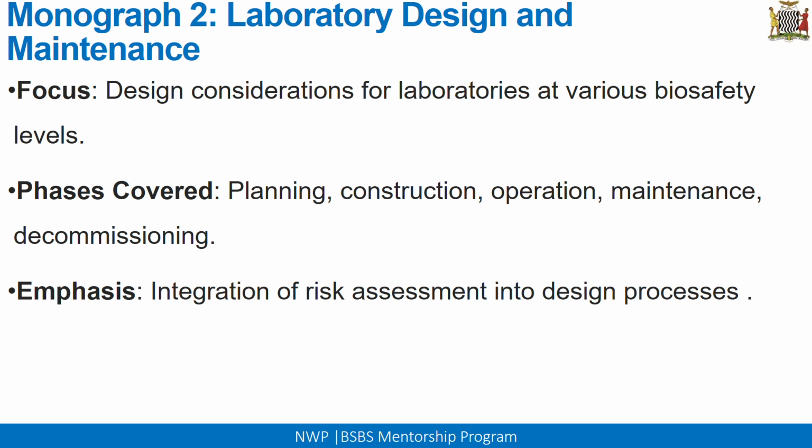So what is the emphasis of this particular monograph? The emphasis is on the integration of risk assessment into the design processes. So even when you're planning on how you're going to design a laboratory, you should always do a risk assessment before you come up with the actual laboratory design.